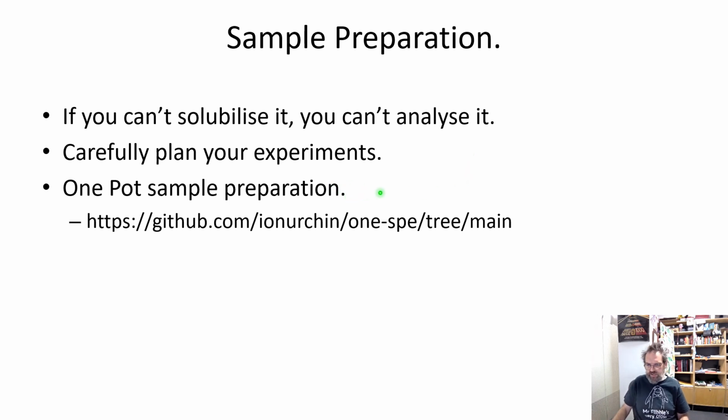One-pot sample preparation is becoming extremely popular, and for very good reason, because when you don't have to pipette things out, or you don't have to do multiple stages where you're transferring things around, the chances of you losing protein, the chances of you losing proteoforms, is massively reduced.